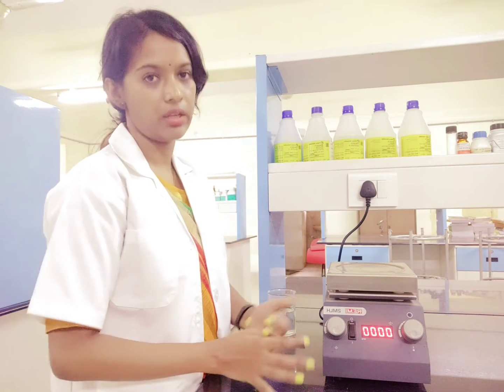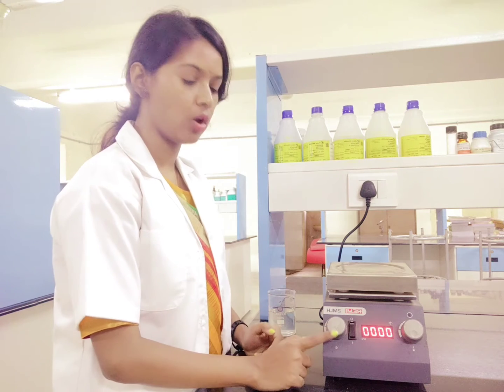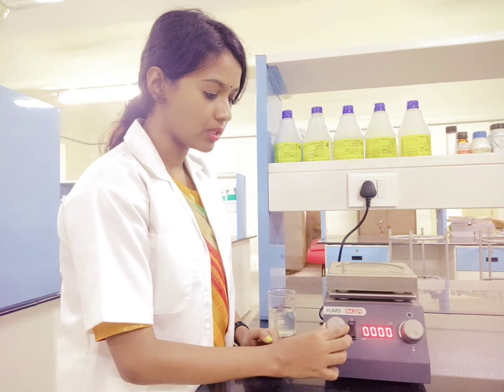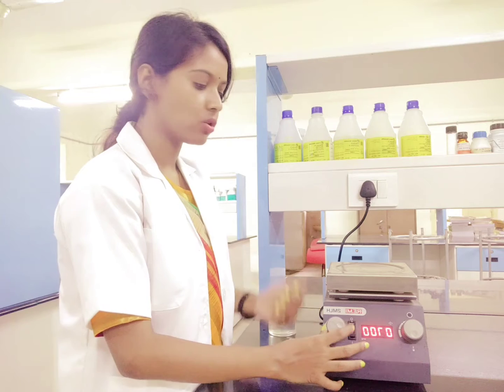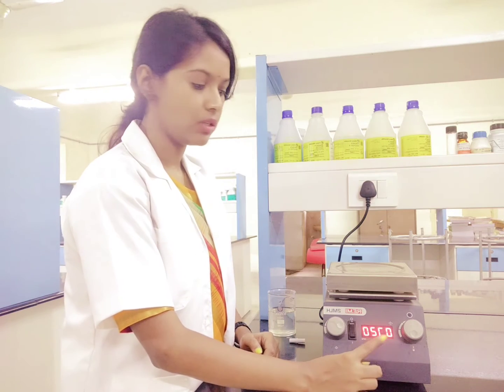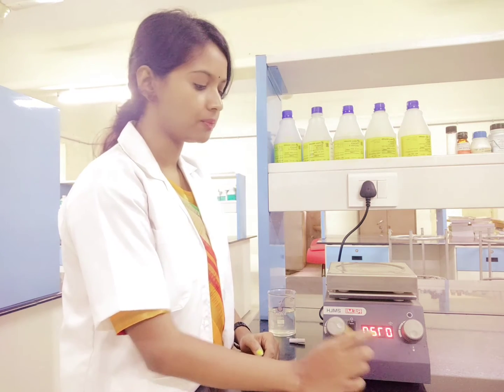The second thing is the stirring effect. For that stirring effect you have this speed regulator. Once you increase the speed — the speed in terms of rotation per minute — you can see what the RPM is; it will be displayed in the display panel.